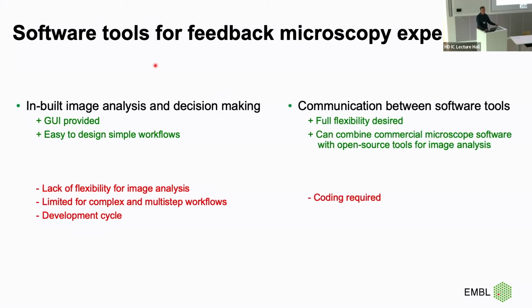That's why we have the alternative way. Although from the beginning, I would say we use both ways depending on the complexity of the project and depending on the demand. The second way, which was already discussed, is that we can set up communication between tools, right? We can say we want, for example, company software to control the microscope, but we somehow want to dedicate the image analysis to our open source tool or another commercial software. Why not? And making them communicate.